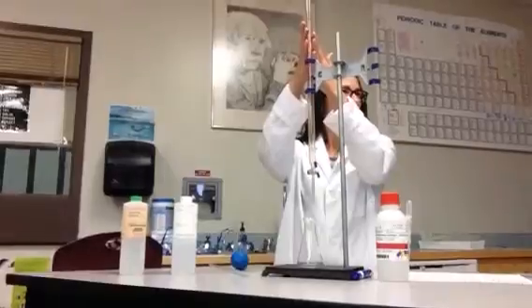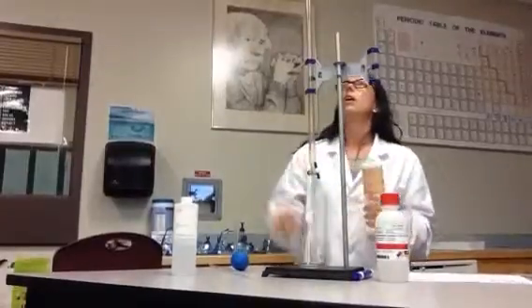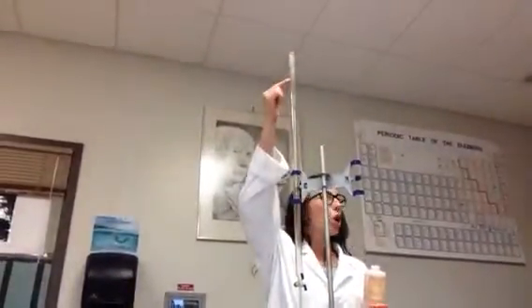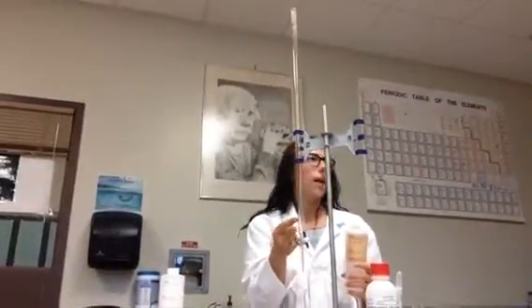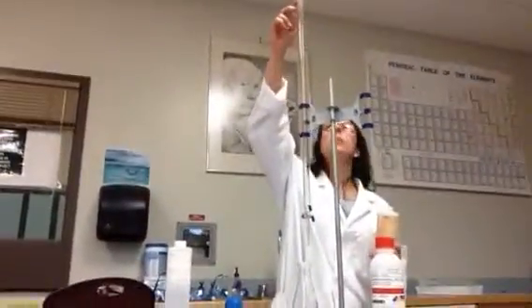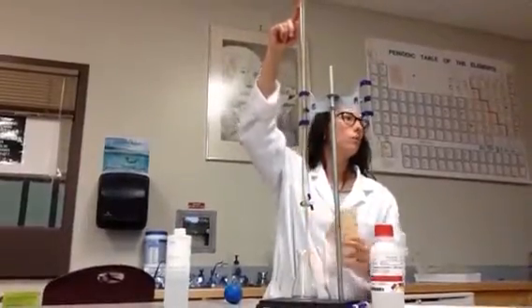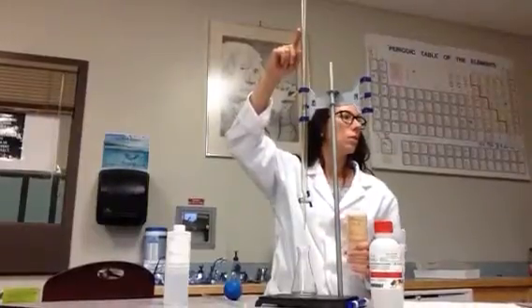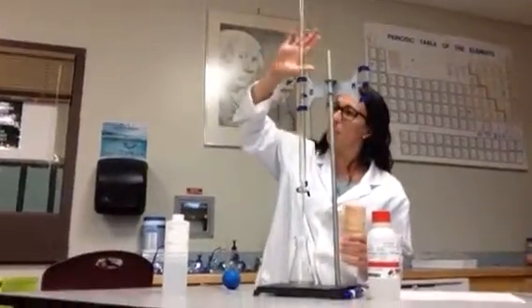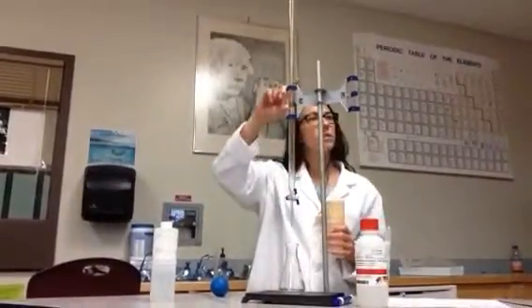Okay, so this is called a burette. Did you know that already? Have we used a burette? A burette measures things from 0 on the top to whatever volume on the bottom. The purpose of the 0 on the top is that I can see that 3 mils came out, 10 mils came out. I really don't care how much is in this burette, I really care how much came out. So the scale is backwards.